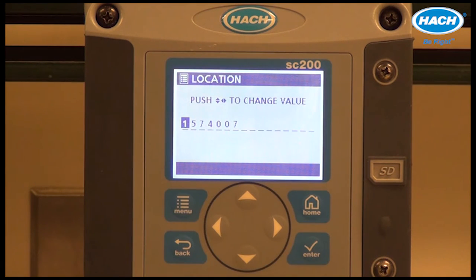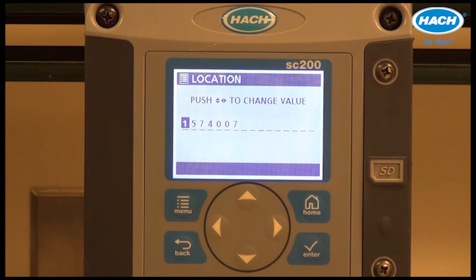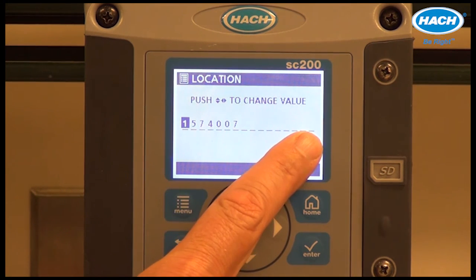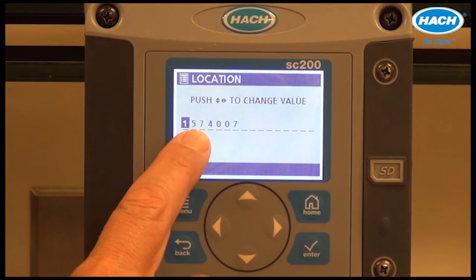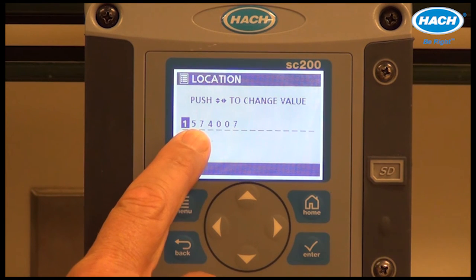The location setting provides the user with the means of creating a sample name for the location — perhaps filter effluent, turbidity, etc. There's a maximum of 16 characters. The default is the instrument serial number.